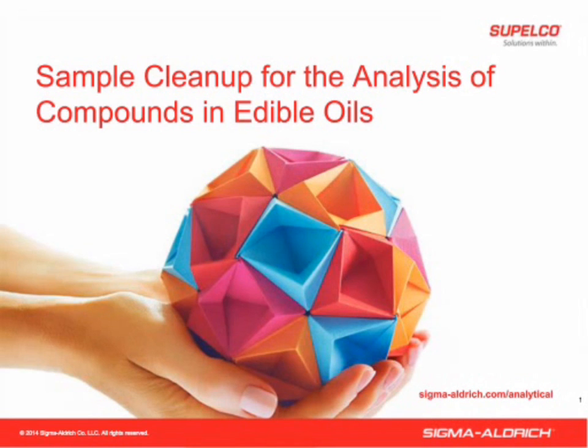I am the SPE product manager here at Supelco Sigma-Aldrich, and we're going to talk about a very difficult sample matrix, edible oils. We'll talk about the sample cleanup for the analysis of compounds in edible oils.